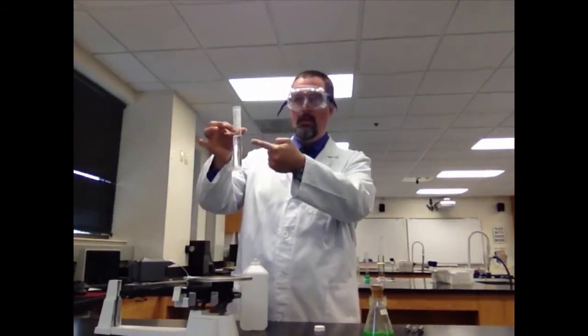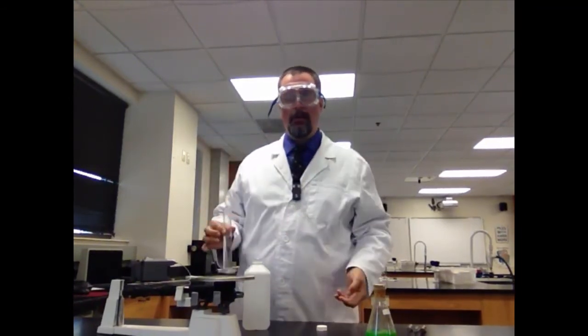The volume's right there. So your mass divided by your volume again. That's your density. So that's all there really is to it. Three solids, three liquids. Take your time. Make good measurements. If you're not sure, go back and make new ones.